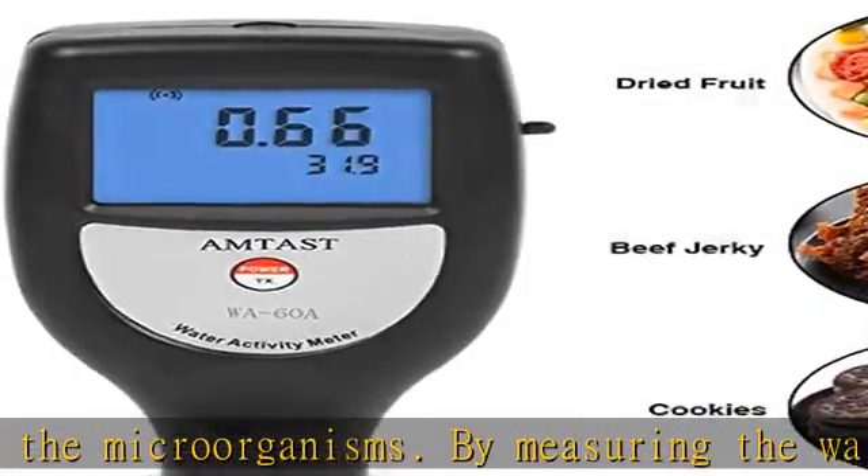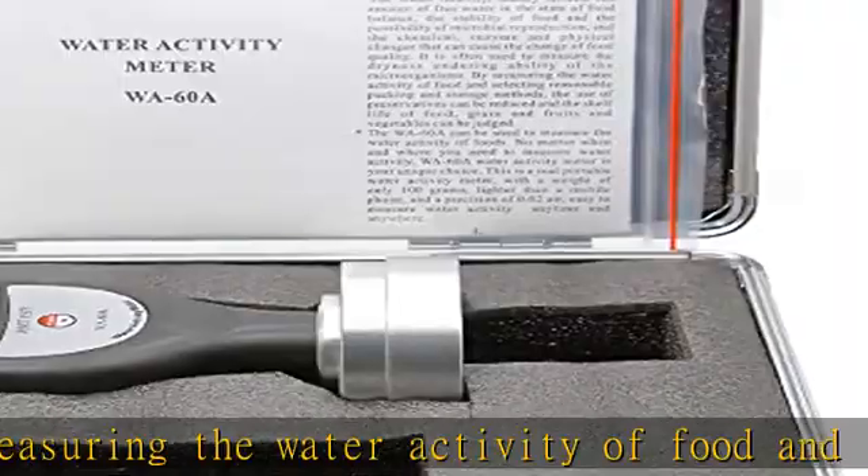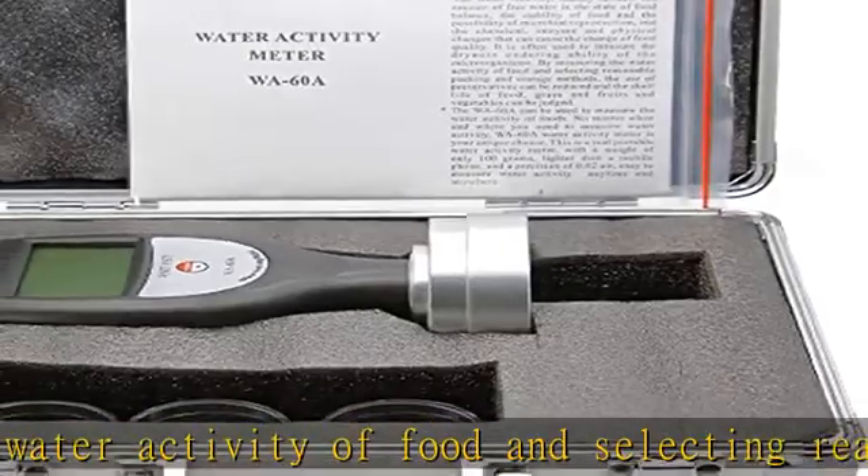Provides Bluetooth data output as an option. Fast testing measures the water activity in five minutes. Sensors and readings are integrated.